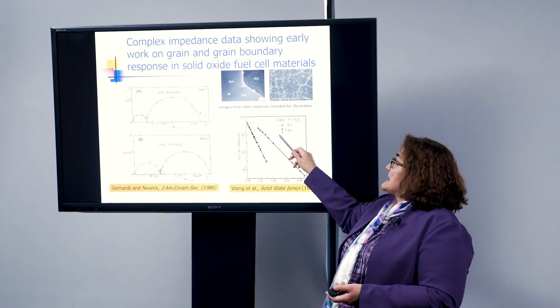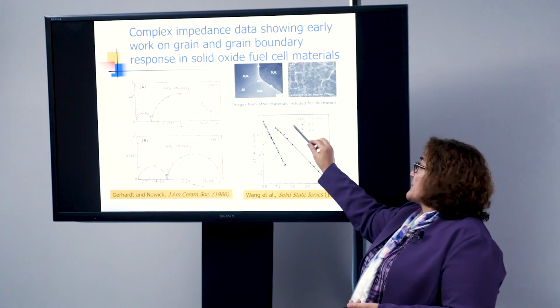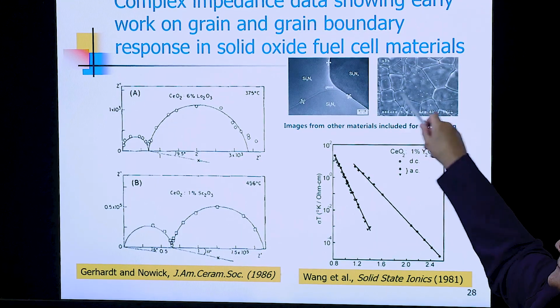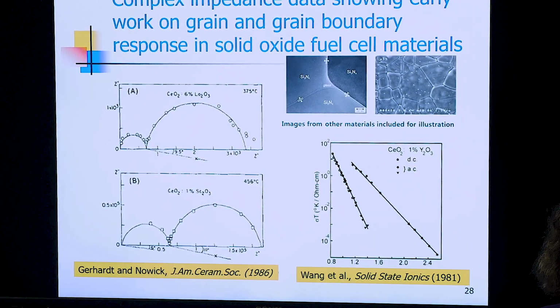And one of the unique things that we did is that with impedance, we were able to separate the behavior of the bulk grains, which are shown, there are 2 examples over here, and what the properties of the boundary regions are.